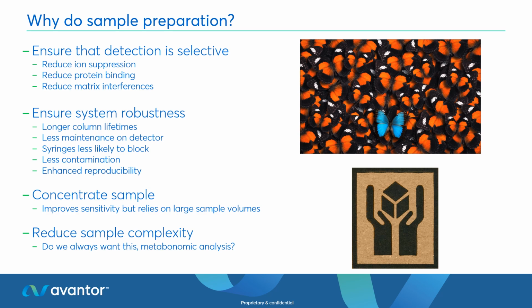It also reduces the sample complexity. So in terms of my chromatography, there are fewer peaks to separate. We may not always want this, particularly if we're doing some form of omic analysis, where we're really interested in understanding the full profile of those individual biomarkers that are present within that biological system.